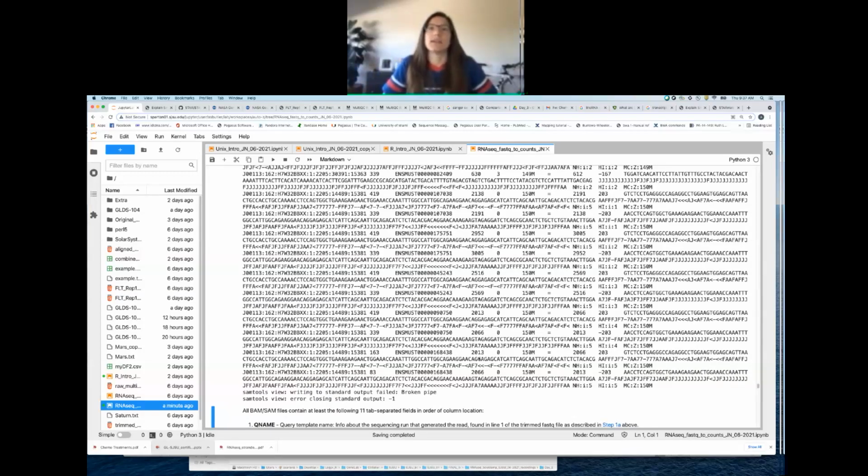And we can see that indeed, let's start here. In the positive direction, that's what that sequence looks like. And then this is the same sequence in that first new line, and then its mate pair as well here. We see it, and its mate pair again comes after the next transcript that it's aligned to. And then we see that repeated one more time. And so we do now see all 5 transcripts that this mate pair is aligning to.